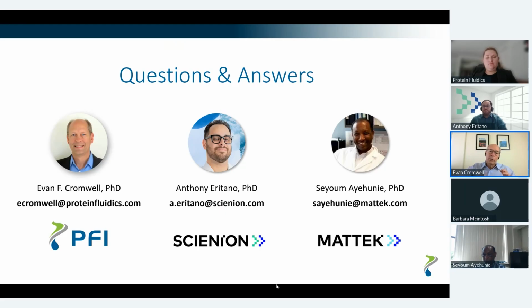So your 2D image algorithms do not work very well with 3D cell models. That's where we feel AI-assisted algorithms are going to be really important to pull out the information that Seyoum was talking about, the information that drug discovery scientists need to develop the next generation of oncology therapeutics. Because of the complex nature of the 3D, using AI algorithms, deep learning algorithms, I think is going to be critical to that analysis in the future.